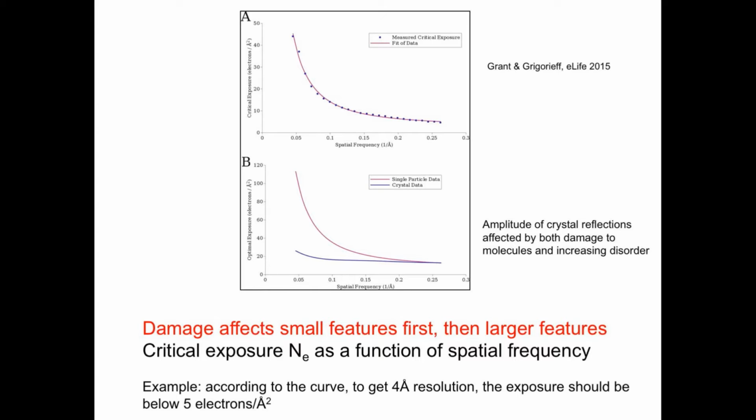So we can define a critical exposure as the exposure to get to a certain point in the radiation damage, and that is a function of spatial frequency.